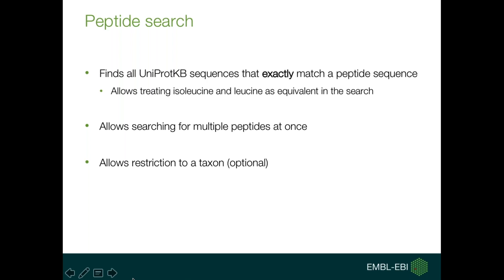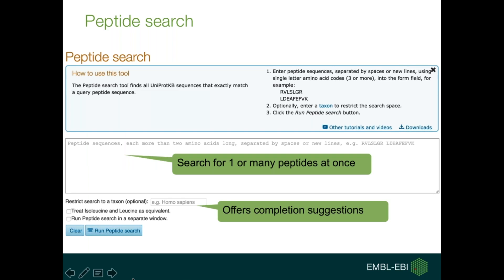Knowing that when doing mass spectrometry analyses, differentiating between isobaric residues like leucine and isoleucine is sometimes impossible, these residues can be treated as equivalent in the search, and will still retrieve hits even if a leucine has to be swapped out for an isoleucine. The tool allows you to search for multiple peptides at once, and searches can be restricted to a taxon — human, mouse, or a higher level taxon.